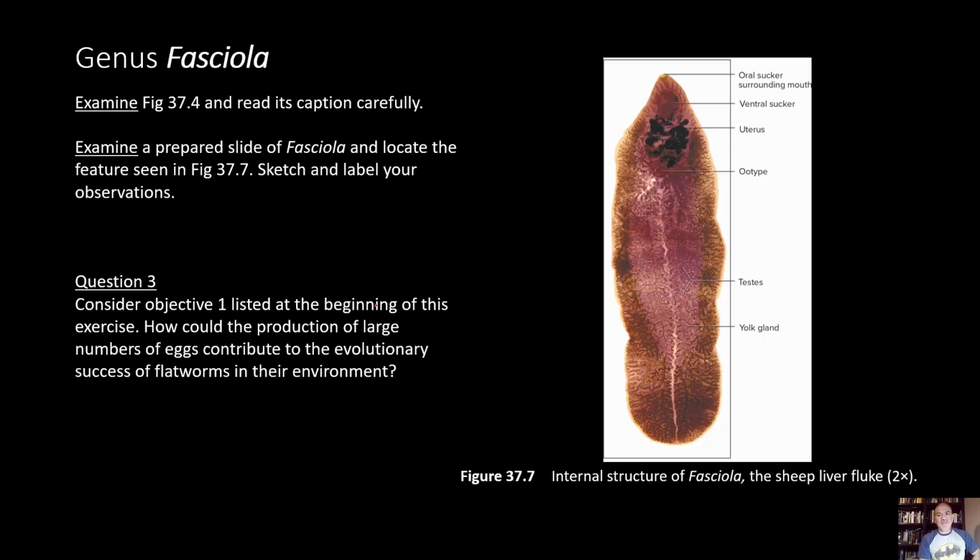Now, another kind of liver fluke, the sheep liver fluke, belongs to the genus Fasciola, and this one's going to be pretty big. You can actually see this. If you had to compare it to inches, maybe an inch, 2 inches in length, nothing bigger than that, as this adult form here, or somewhere between 2 centimeters and 5 or 6 centimeters. Pretty big. You can see it without a scope.